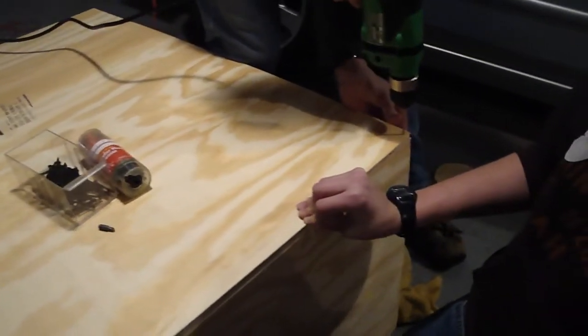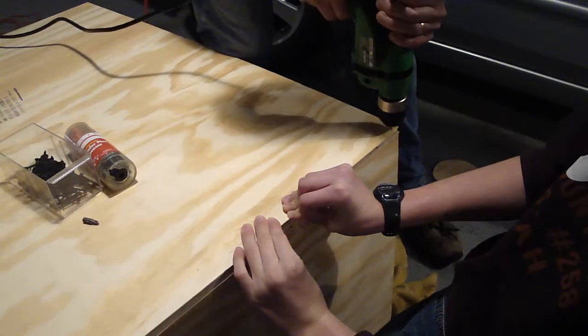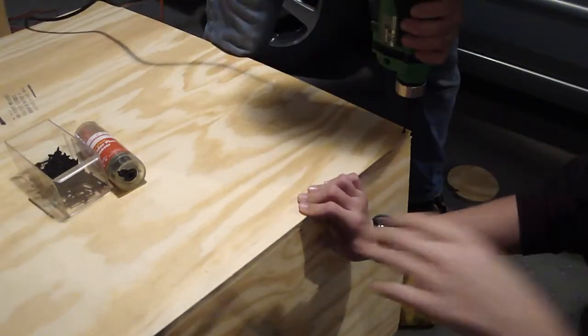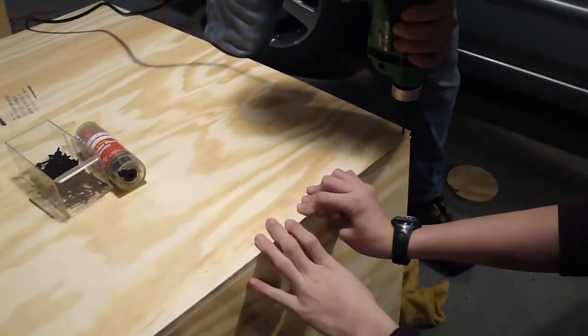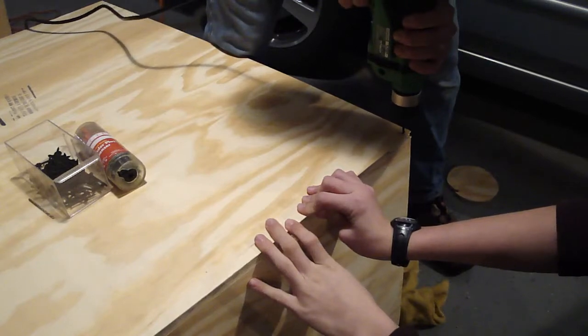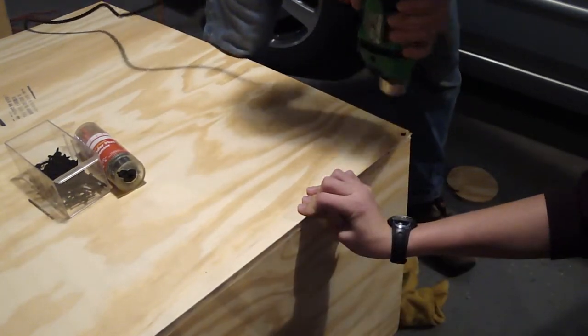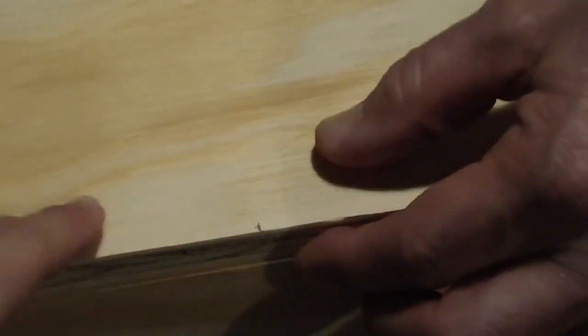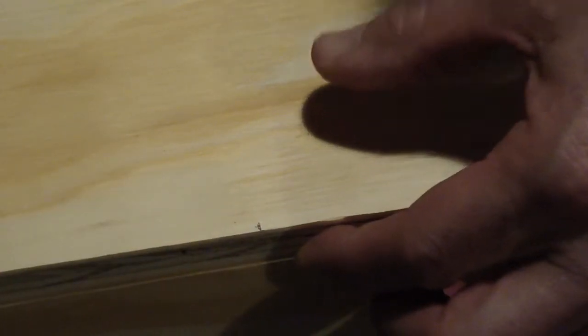Drill the second hole. We're going to put in the second screw. We made a mark in the center, and we're going to drill a hole and put a screw in. Putting the screw in.